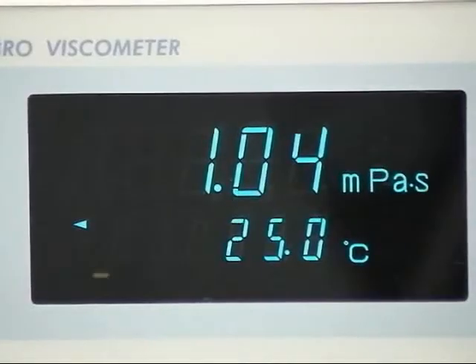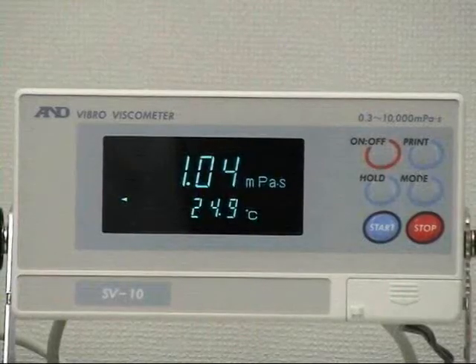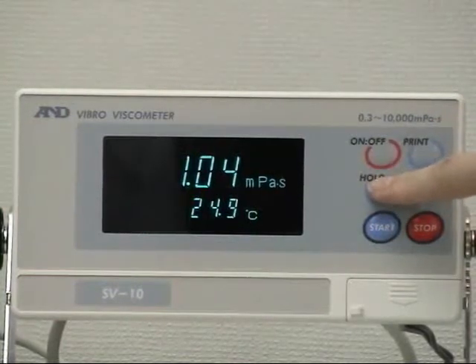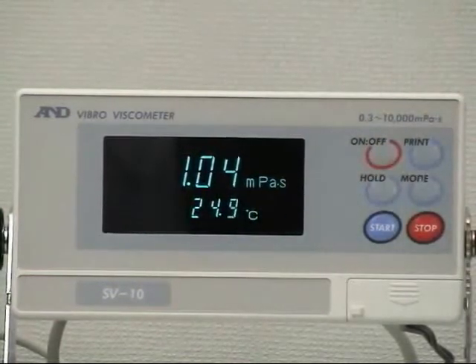In the hold function, the processing indicator blinks to show that measurement is still processing. Press the hold key again to release the hold function, and the display shows the viscosity and temperature on a real-time basis again.